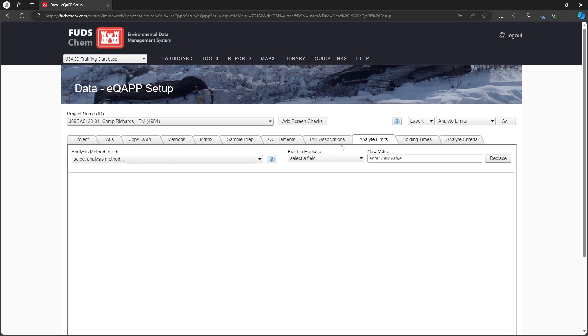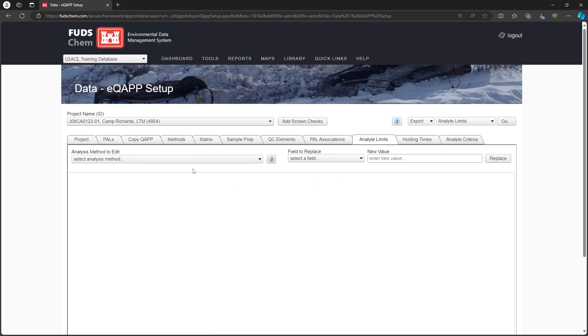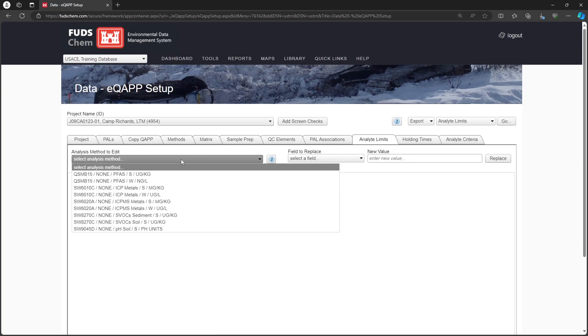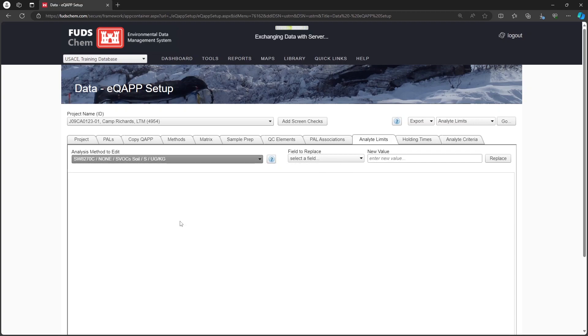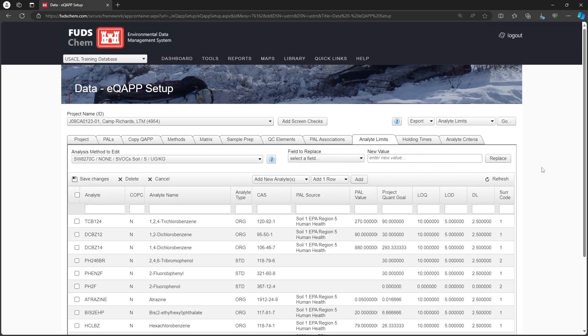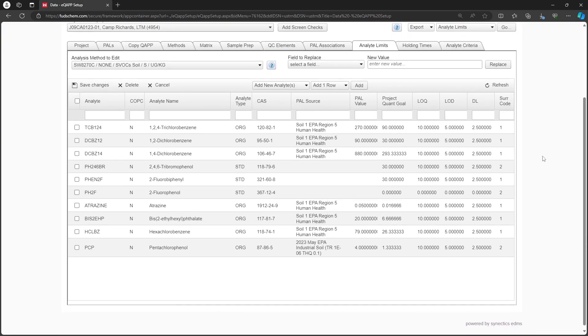On the Analyte Limits tab, select the analysis method to edit. For this example, we'll choose SW8270C Soil. On this tab, we can delete unnecessary analytes and add needed ones.